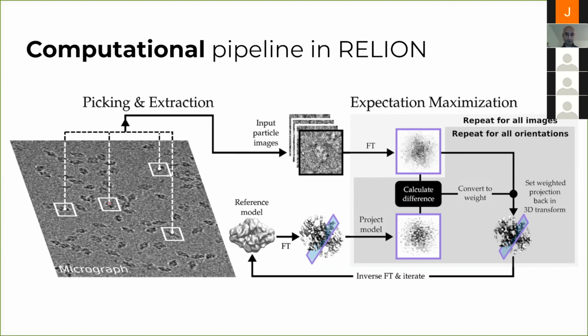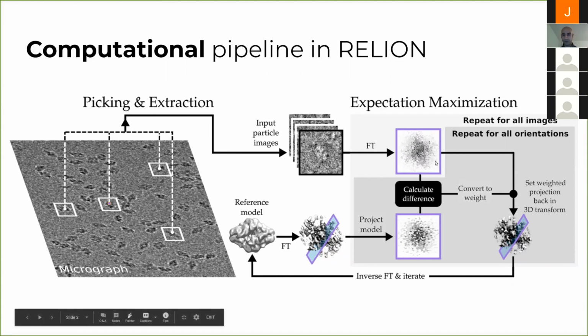I'm going to be mainly focused on 3D here, but these algorithms are interchangeably applicable to both 2D and 3D reconstruction, where basically what you do is you take your data, your stack of thousands or millions of images, and then you iteratively use those to reconstruct and refine a 3D model or a 2D model of something that looks like a protein, and eventually, using that data, it becomes more and more similar to what you have in your images. And this is done in Relion currently.